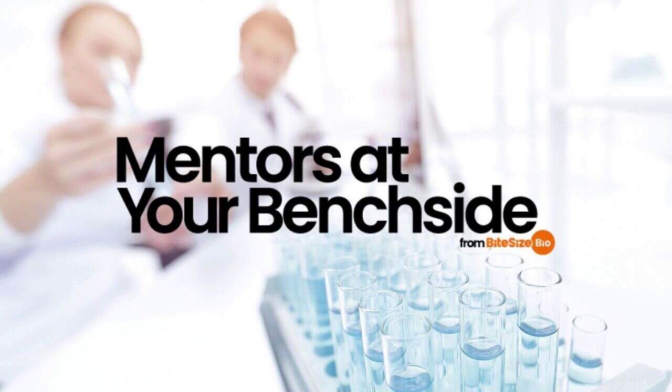Ponceau S can be purchased as a pre-made solution or as a dry powder. To make a 100 ml solution from the powder, weigh 100 milligrams of Ponceau S powder and make it up to 95 ml with distilled water before adding 5 ml of glacial acetic acid. The final concentration will be 5% volume for volume glacial acetic acid and 0.1% weight for volume Ponceau S. Store the prepared solution at either 4 degrees or room temperature, but ensure you protect it from light.